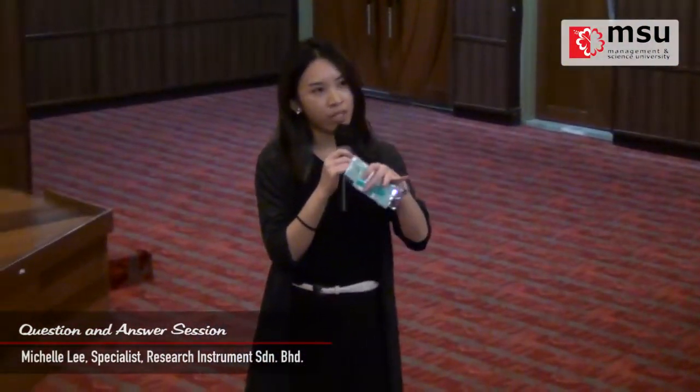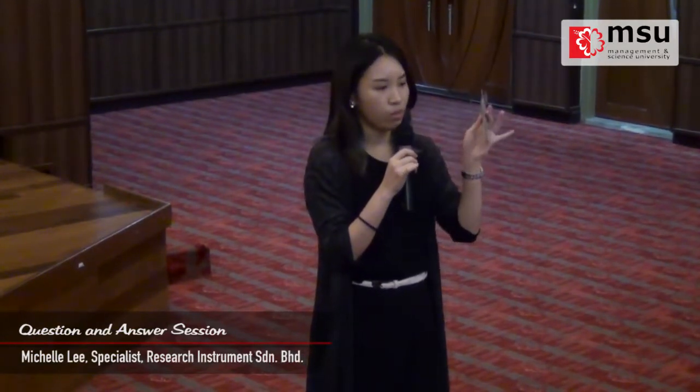Let's say for the automatic sampling, the one that does the sample application, there's actually an auto rinsing, which means that every time they apply the sample, you do an auto rinsing. Because there is a rinsing bottle and then a waste bottle, you don't need to do anything. About the development chamber, after the development, there will also be auto rinsing. So generally all is auto rinsing, you don't need to clean it. Then the visualizer, of course, you just place the plate, there's no cleaning requirement, as well as the scanner. Okay, so everything is auto rinsing.